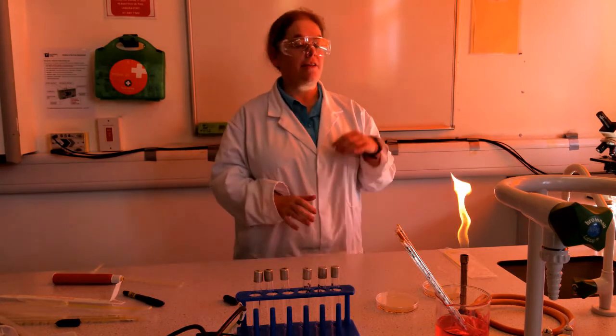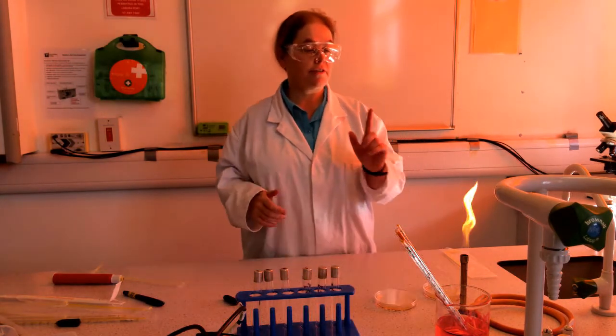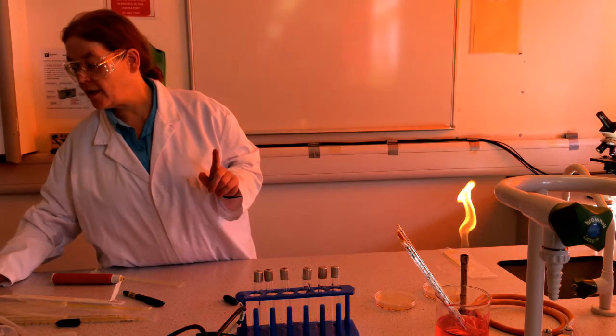Right, okay, there only remains then to go over there and get the ones I prepared earlier to show you the sort of results you might get. Wait there one sec.